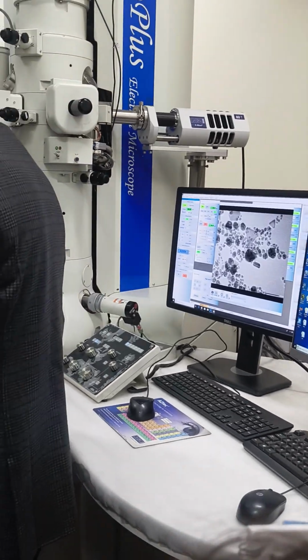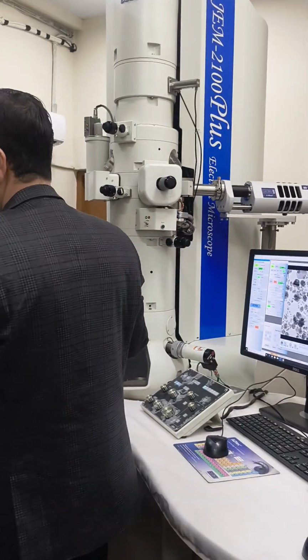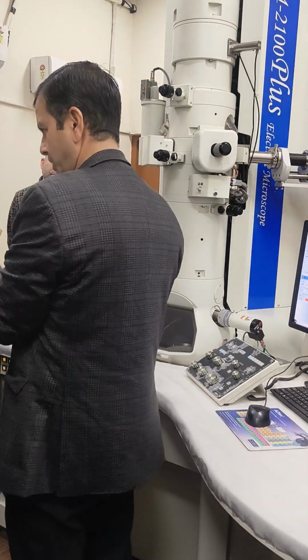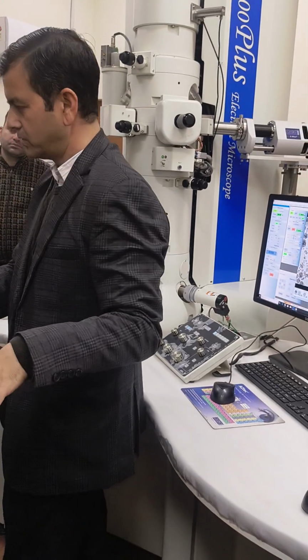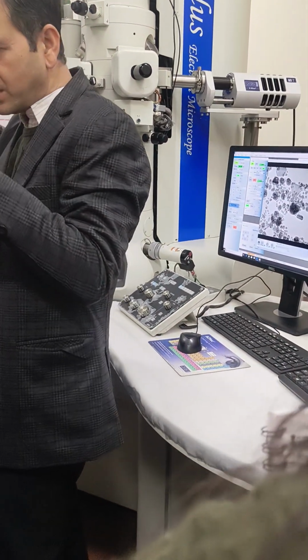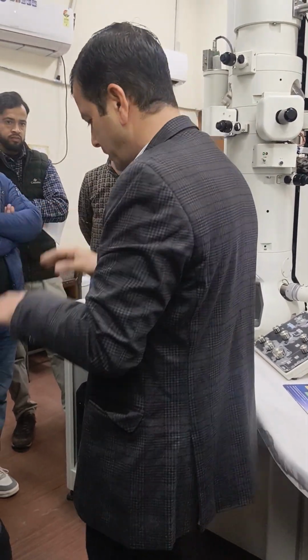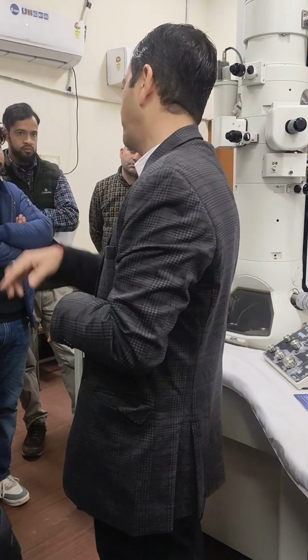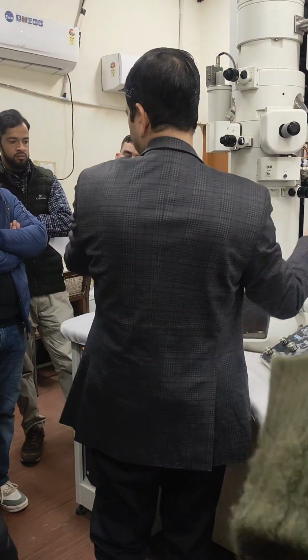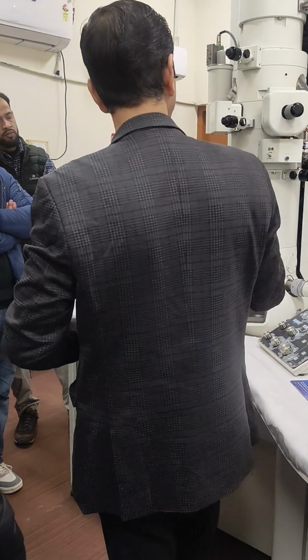The fundamental principle is the same, everything is the same. Layout wise, many times you find some are bigger. If it is 300 kV field emission or 200 kV, it has a bigger diameter because it needs more isolation from the external environment. It doesn't tolerate much vibration, because when we do high resolution imaging, it can dislocate or resonate. When we tap strongly or there is movement outside, it disturbs the high resolution image. So due to that, the column is broader in the case of 300 kV or bigger TEM.